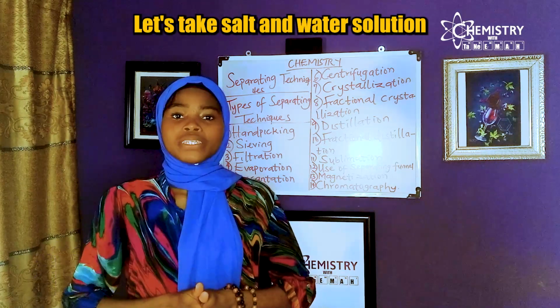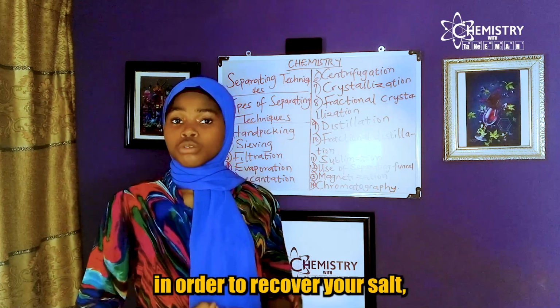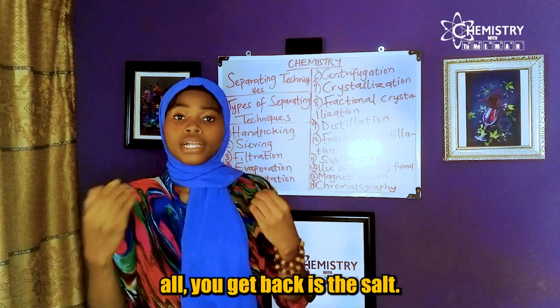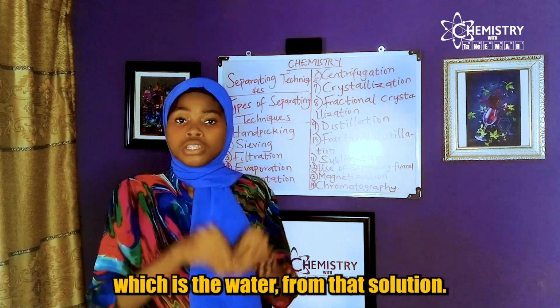Let's take the salt and water solution that we discussed in evaporation, for instance. When you heat the salt and water solution in order to recover your salt, the water escapes into the atmosphere, and that's the end of it. All you get back is the salt. But let's assume you also want to recover the solvent, which is the water, from that solution.